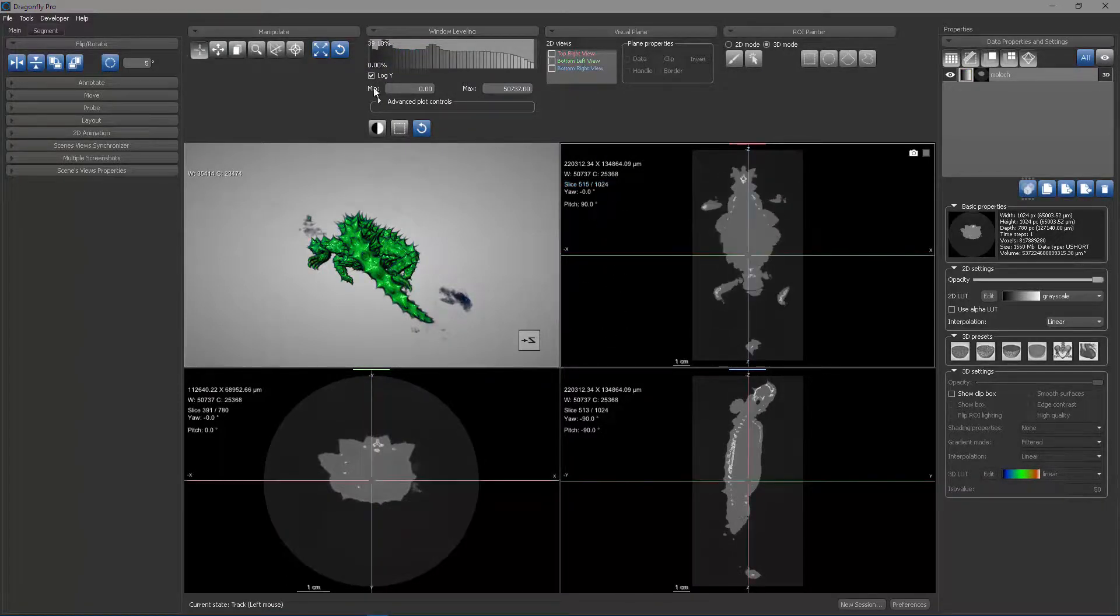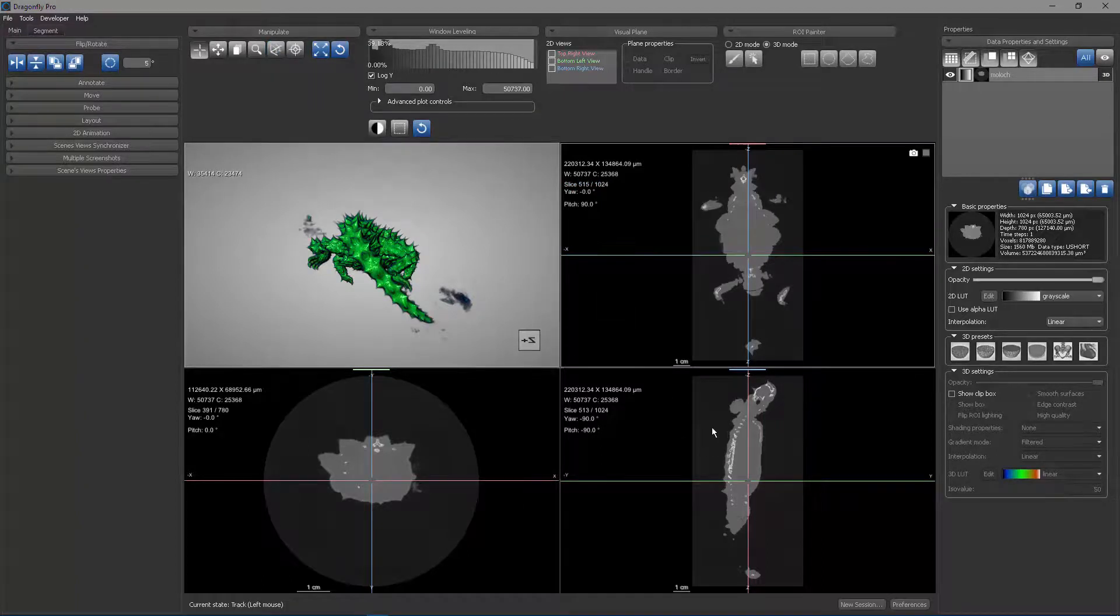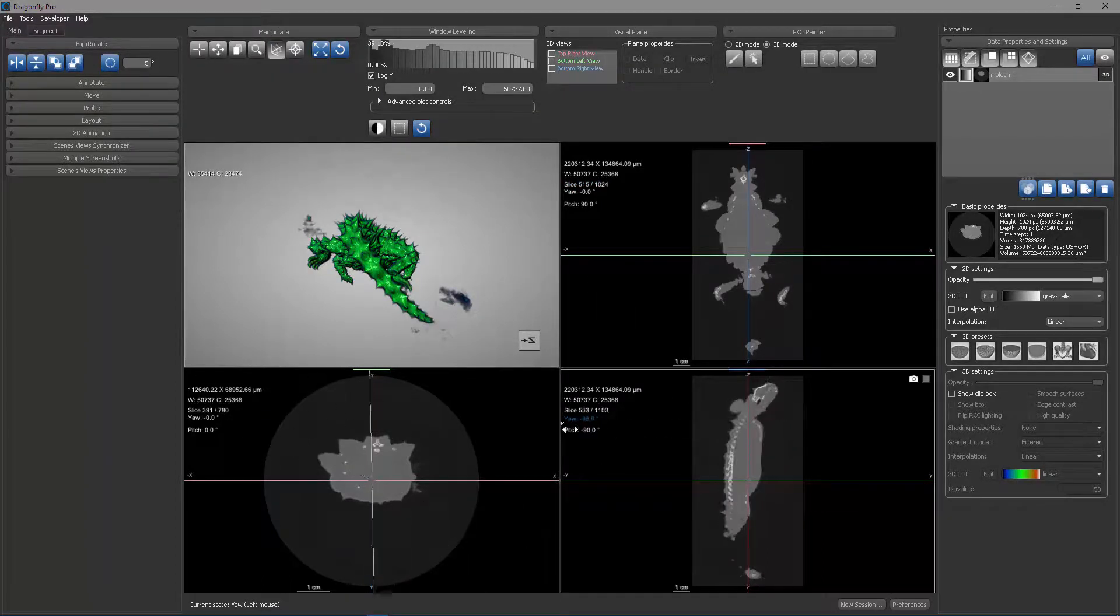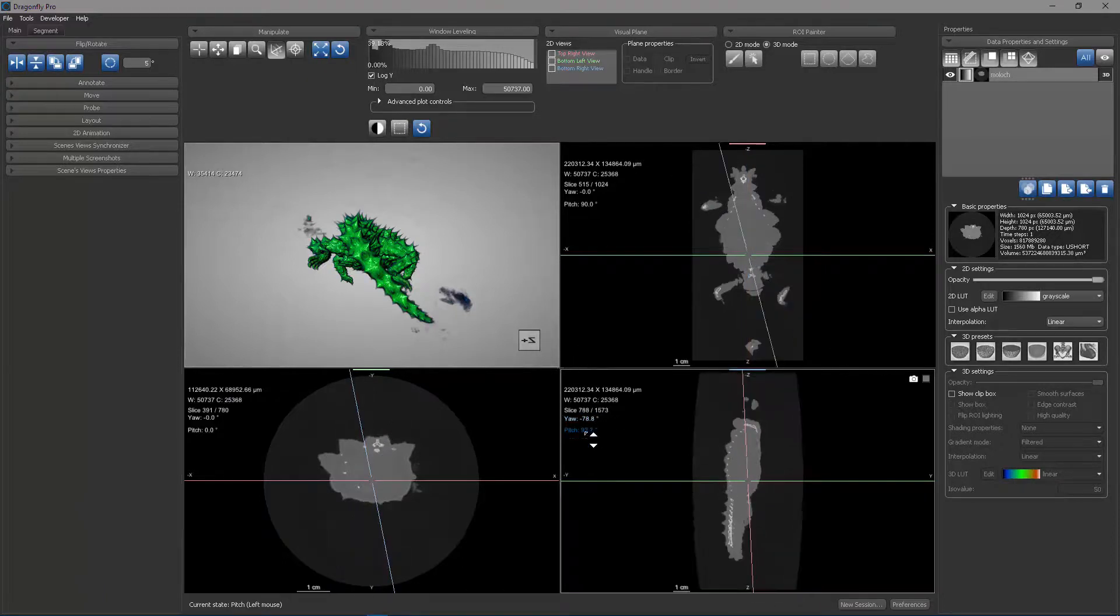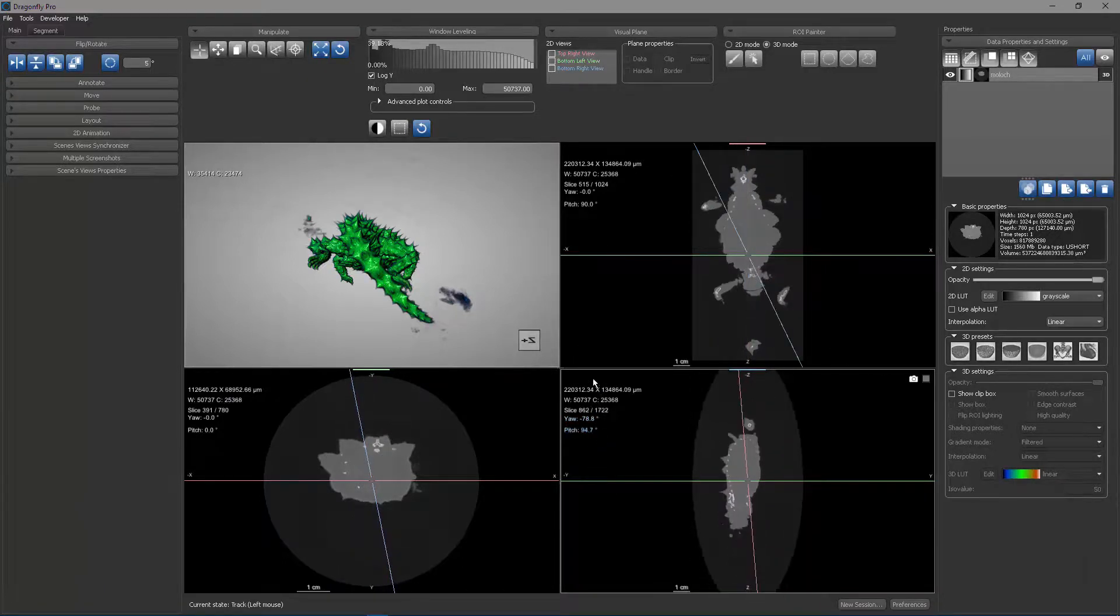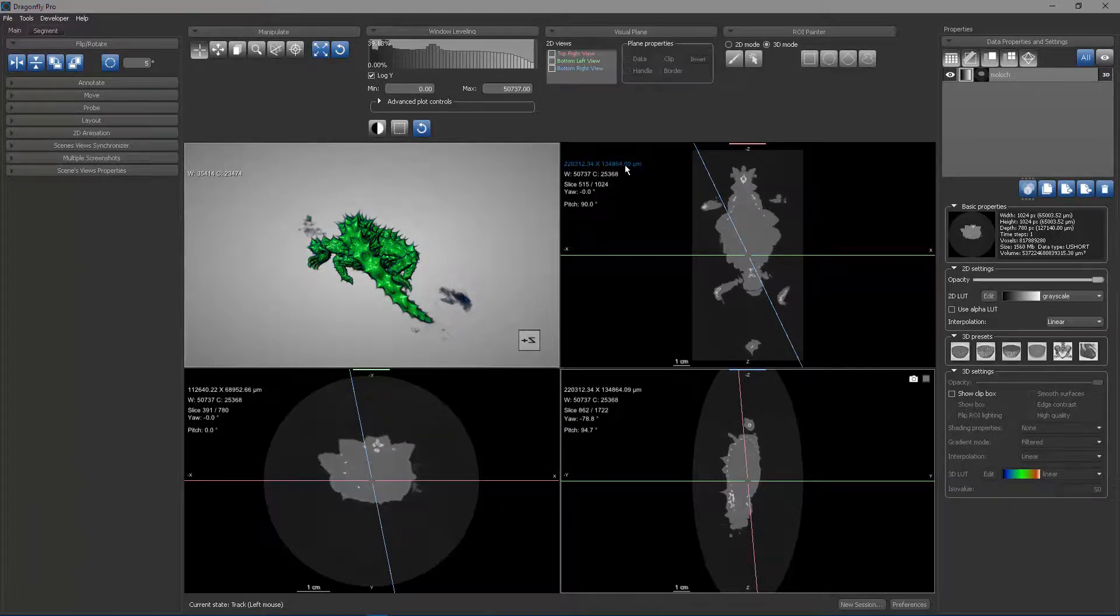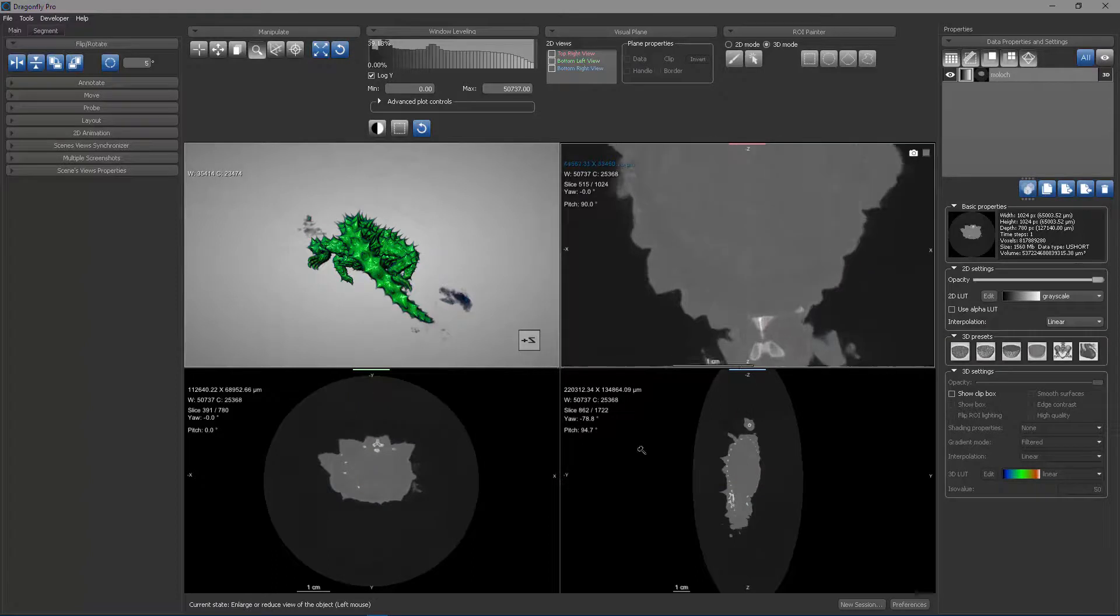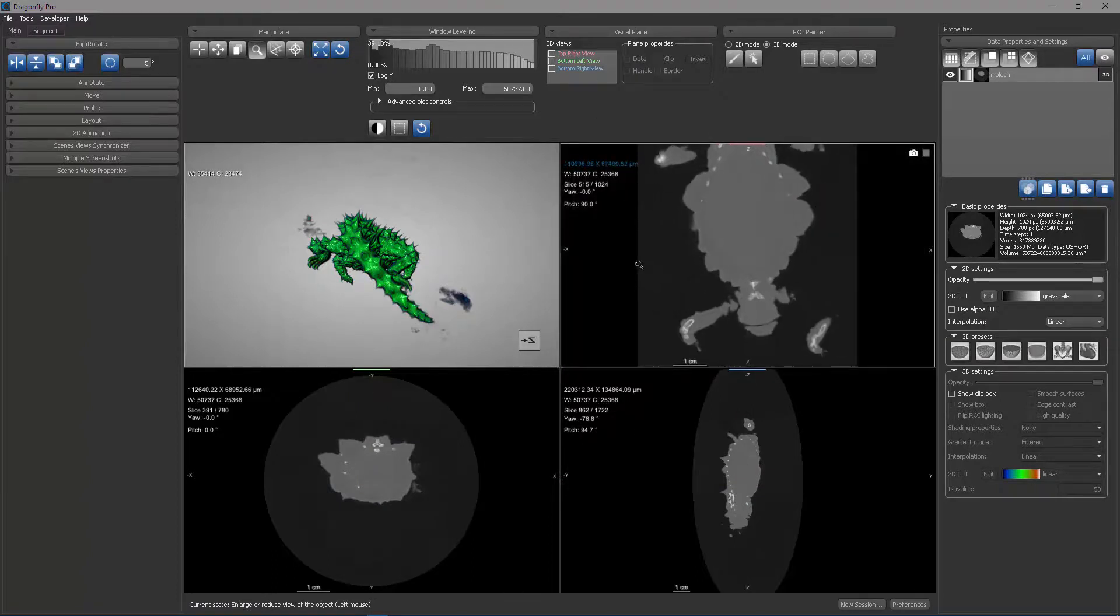We saw that the walk state allows you to adjust the yaw and the pitch, but that can also be done by dragging horizontally on yaw or vertically on pitch. We've seen the zoom state will let you zoom in and out. That can also be adjusted by dragging on the field of view text presenter to zoom in or zoom out.